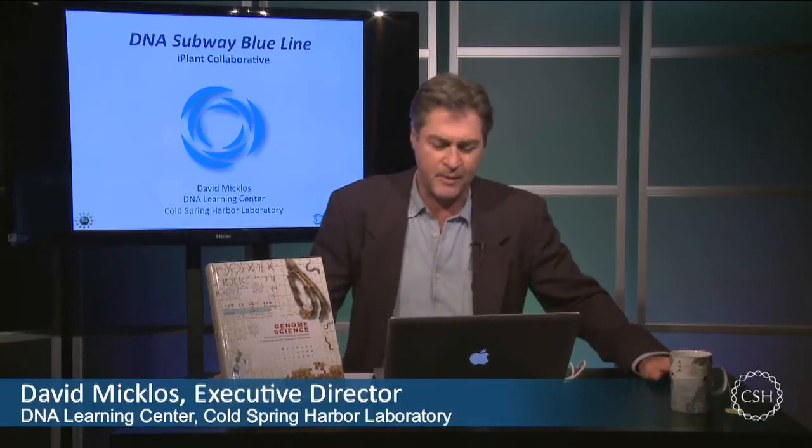We're here in the Laurie Landau studio where I'm bringing you a webinar on the blue line of DNA subway. We have about 12 people online, so that's great. I'm going to show you how to use this tool, give you a little background on why it's important and how you might use it.